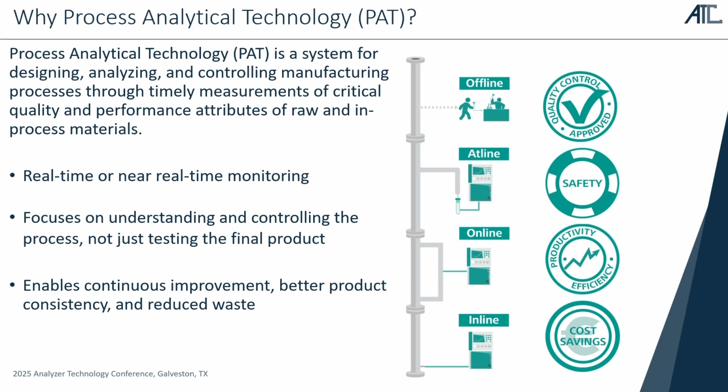And just a refresher on process analytical technology: all that we do with those process analyzers, we really design systems that allow you to analyze, control, and monitor what is happening in your production in real time, and then in real time be able to make decisions based on those results.